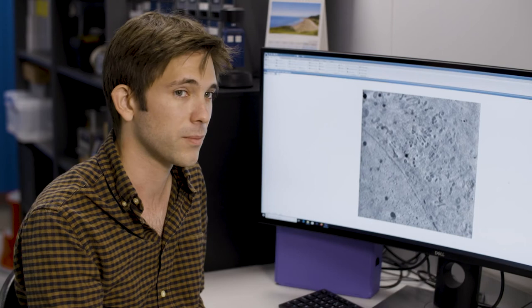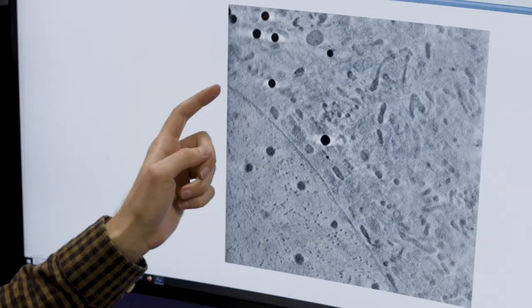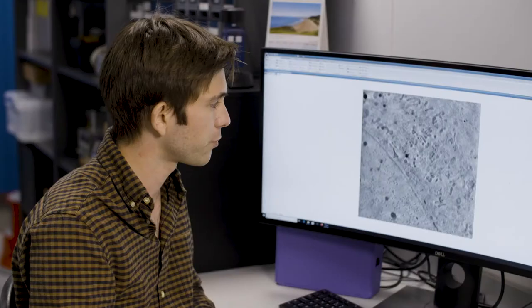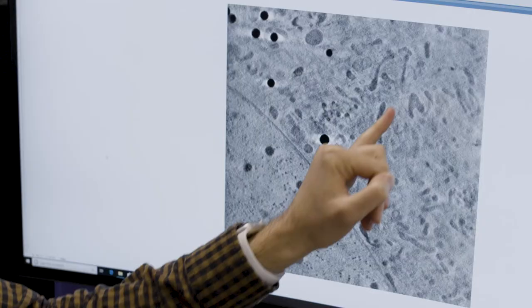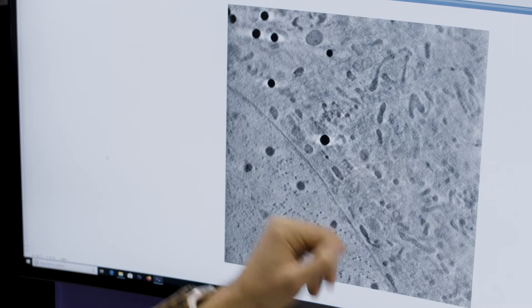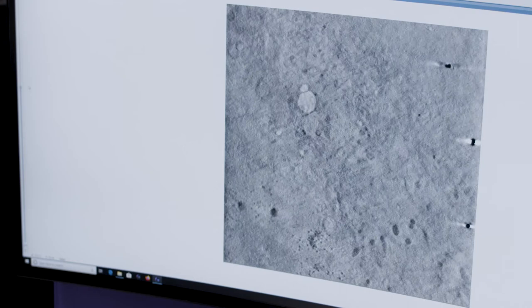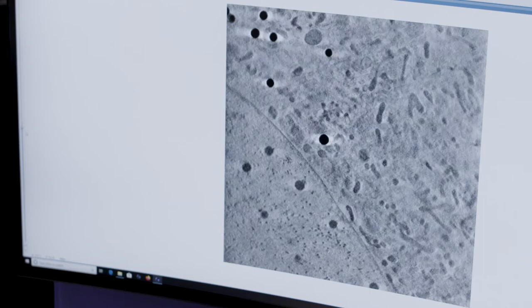So for instance, here we can see the nucleus on the left, and this is the nuclear membrane here. And all of these black dots in here are the viral capsids. And then on the other side, we have the cytoplasm, where you can see components such as the mitochondria, which are quite dark. And these really dark spots are lipid droplets. But what's really great about this technique is you can image the entire depth of the cell, so we can actually produce a three-dimensional image that we can scroll through.